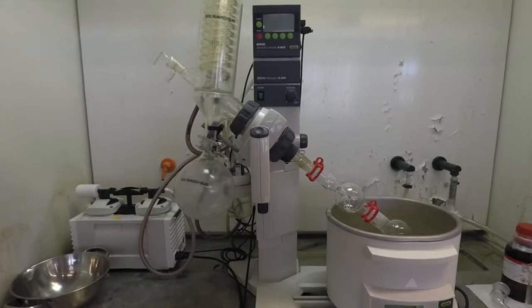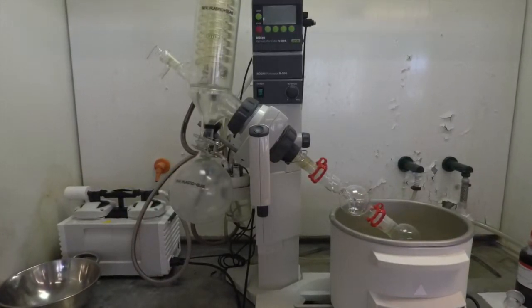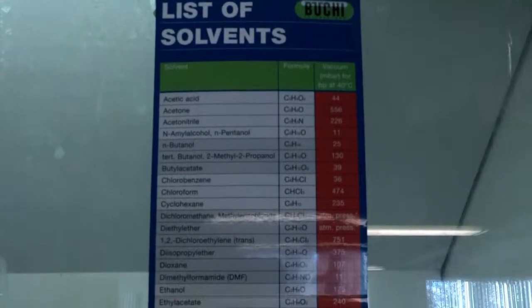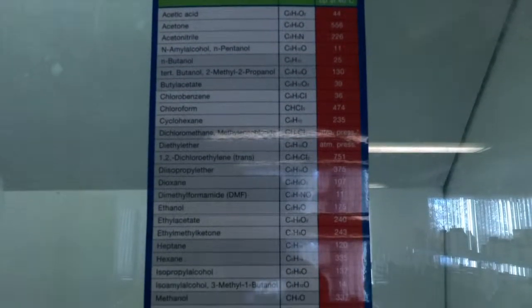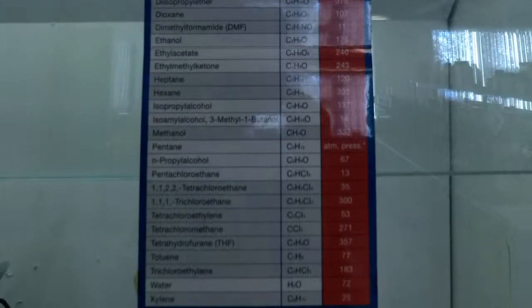Before beginning the evaporation process, it's good to know the pressure required for your solvent to evaporate at 40 degrees Celsius. On the hood, there is a handy guide that lists the most common solvent's boiling points at this temperature.